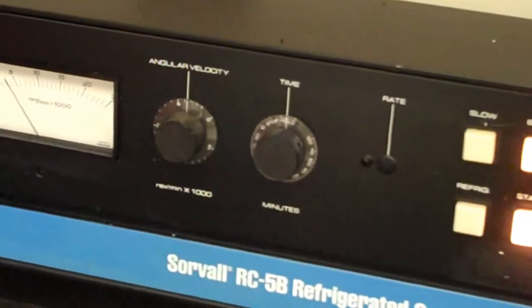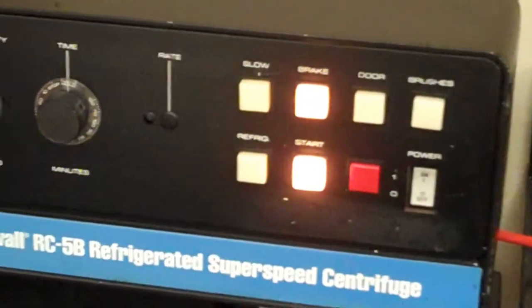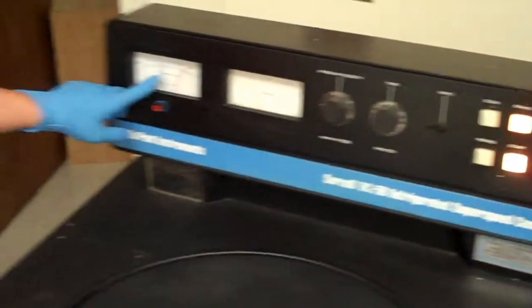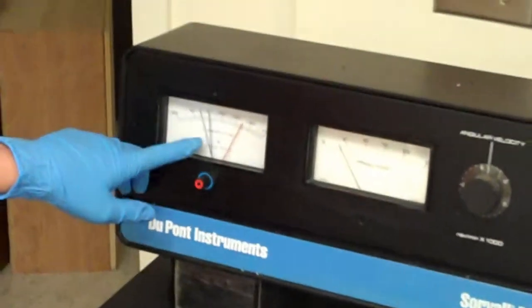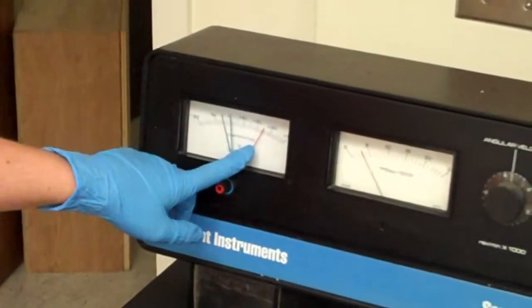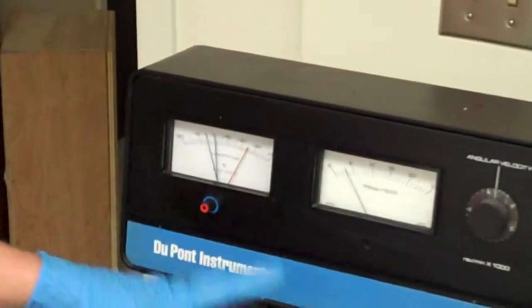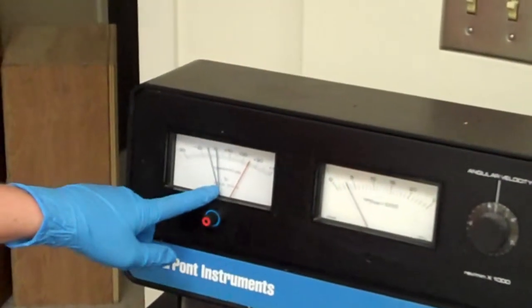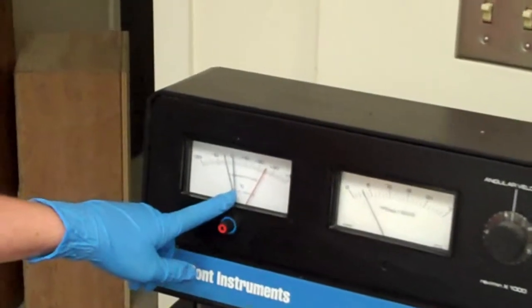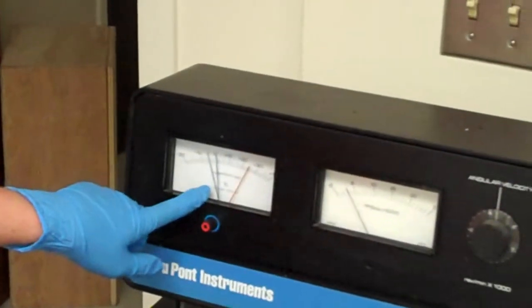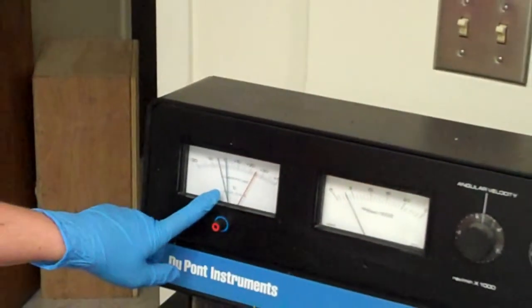The only way that this centrifuge will cool is if it's running. So once we get it down to the temperature that we want, you set the red at the overheat temperature, which means that your samples can't get hotter than this temperature, and the blue is your cold temperature. The black is the temperature of the centrifuge at the current moment.